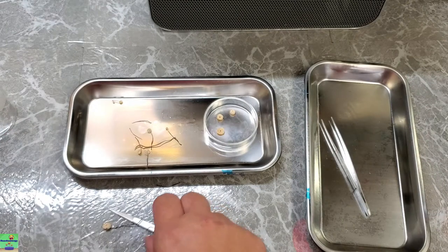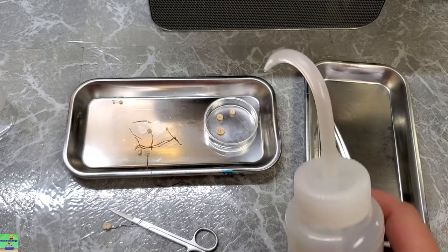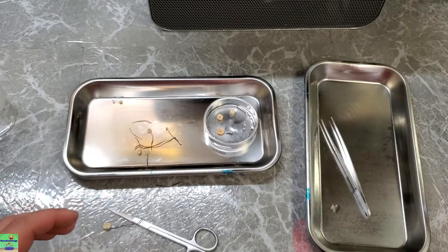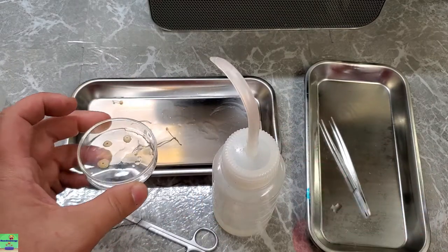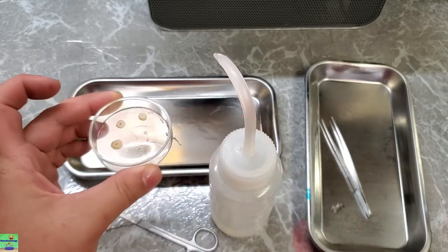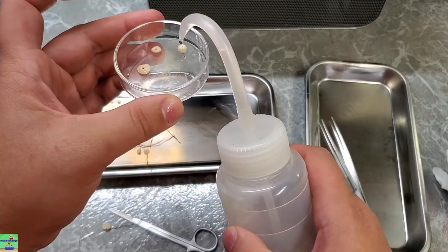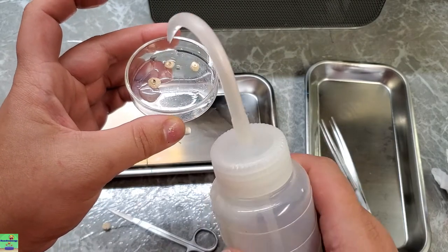Now, what I like to do is, let me get my wash bottle here. I just like to put, I don't know why it put that much on. I normally don't put that much on. It just kind of squirted out. That's fine. I don't need that much water here. Not for these little guys. But, yep. There. Just one drop on top of each one.